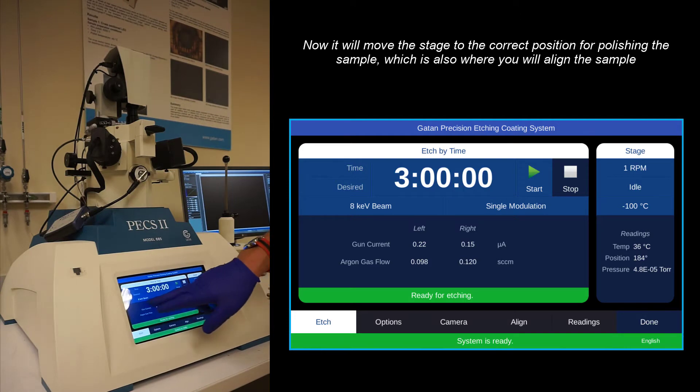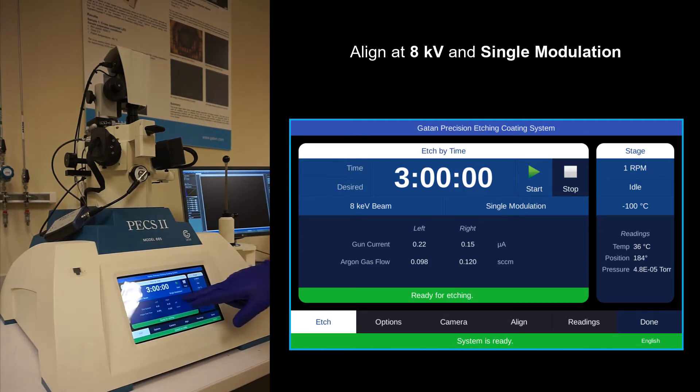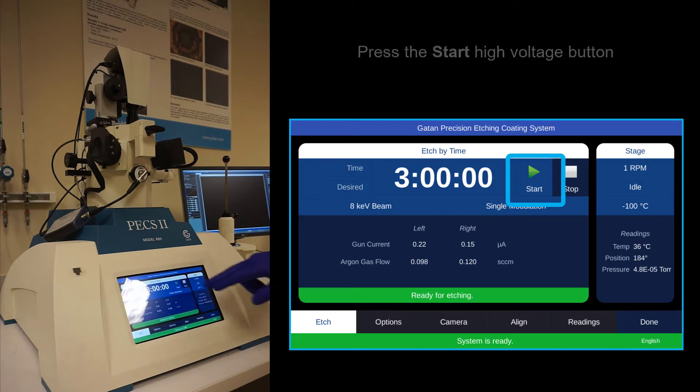When you align, add 8 kV with single modulation, and then the time doesn't matter because it will only take about 30 seconds. Turn on the high voltage.